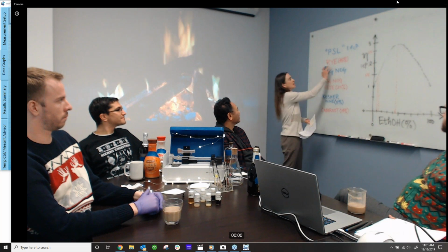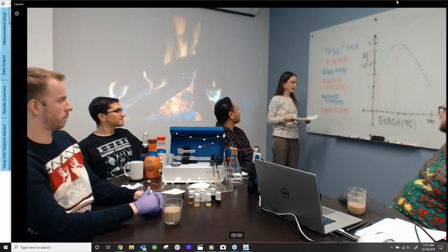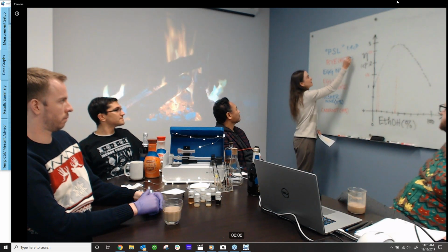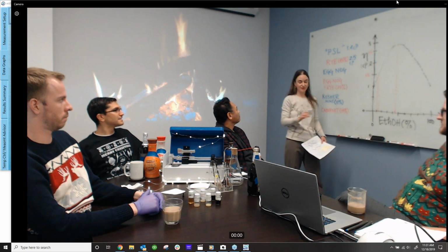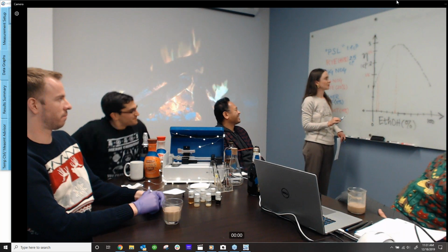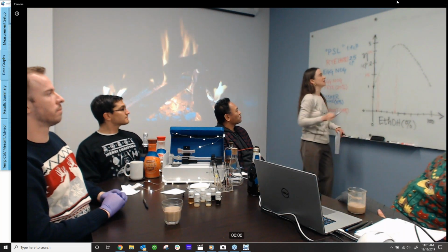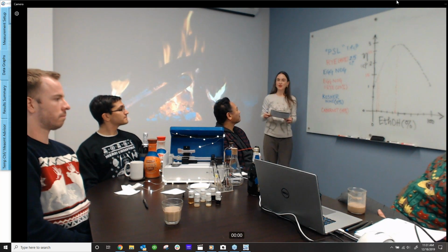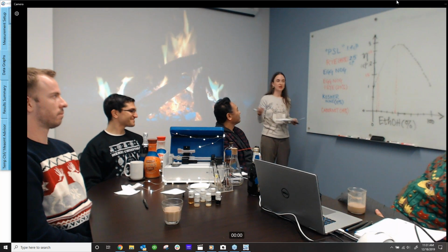So the rye whiskey that we purchased was labeled as about 45% alcohol content, and the viscosity is coming out at about 2.5 centipoise. I was trying to draw this to be predominantly realistic. So if we look at about 45% alcohol, that is coming out to be about 2.5 centipoise. So we did get our money's worth here, and that seemed to be a realistic value for that particular product.